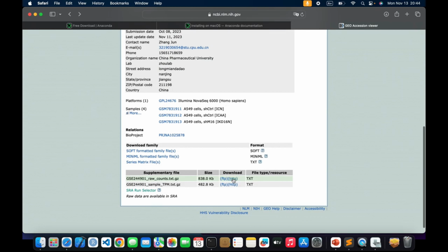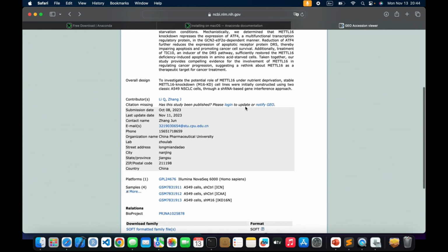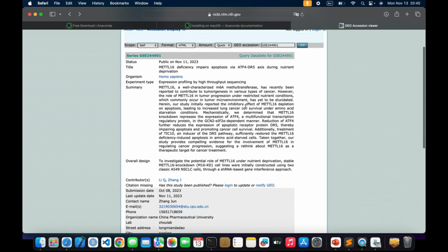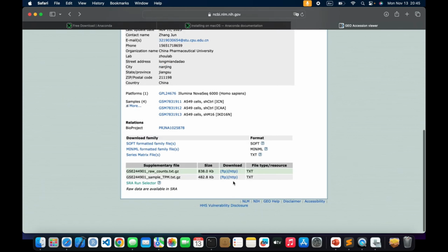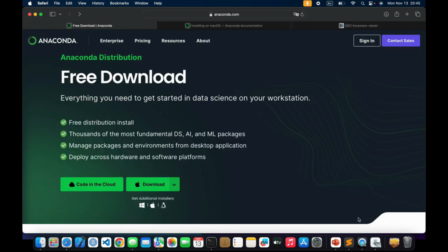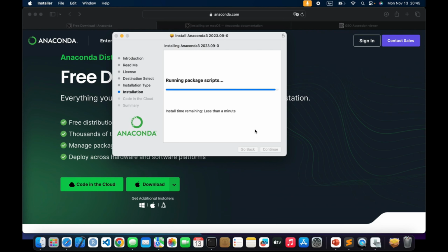Also you can download by clicking the link, but I just want to focus on Python programming skills in this tutorial so that you can learn a little bit of coding and showcase your skills rather than depending on going into the browser and downloading by clicking these links. You can click here and it will be downloaded. I mean, that's easy, but how you can achieve it using Python programming, that's really important, so that you can learn Python alongside and also implement your skills.